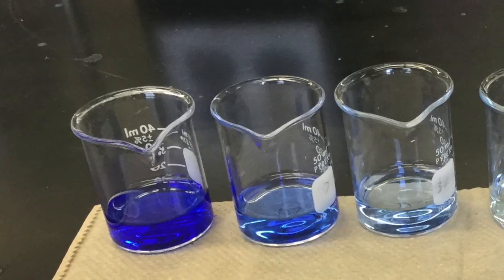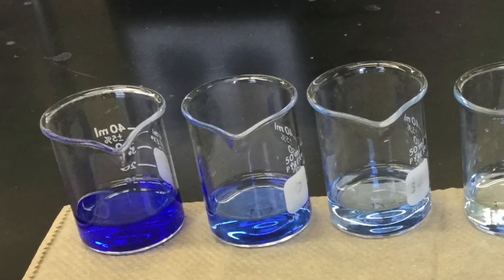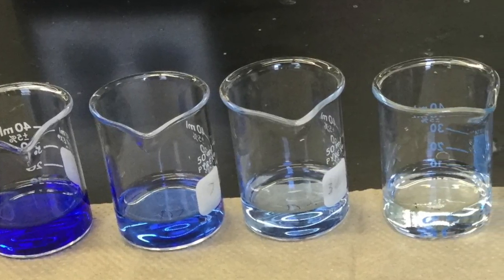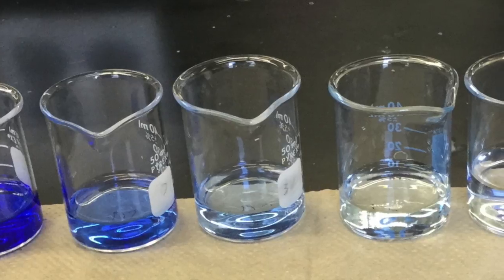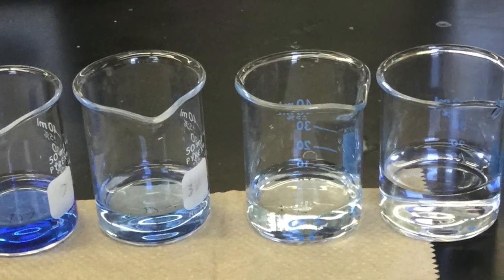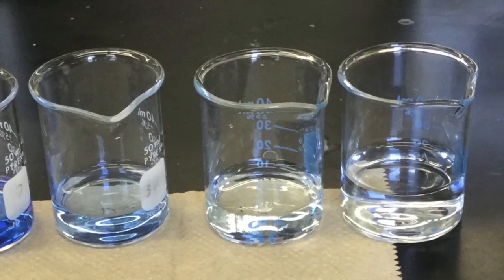Imagine being given a series of samples with varying concentrations. Without knowing anything about these samples, it would be nearly impossible to derive its concentration. But we can actually use a strange property of light to help us figure out the concentration of these samples.